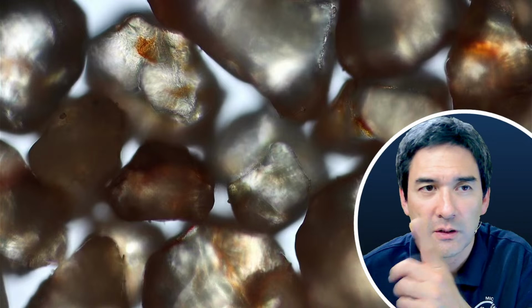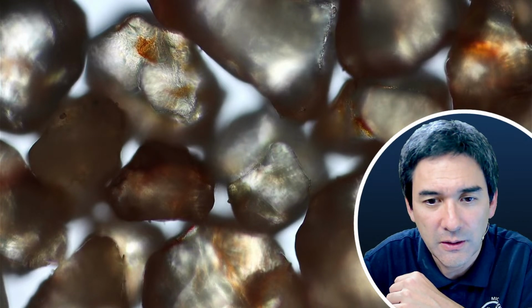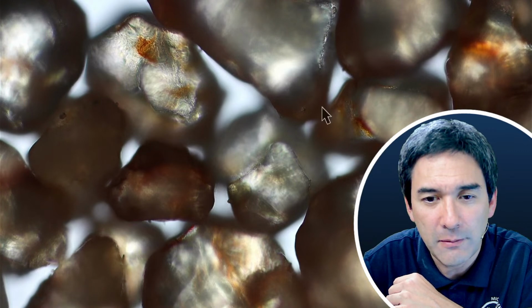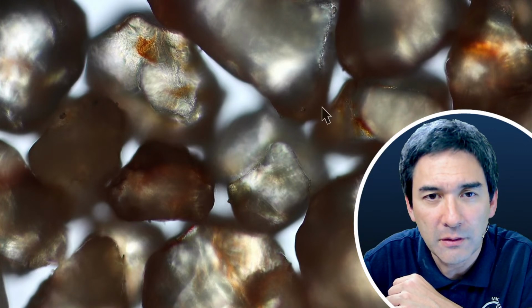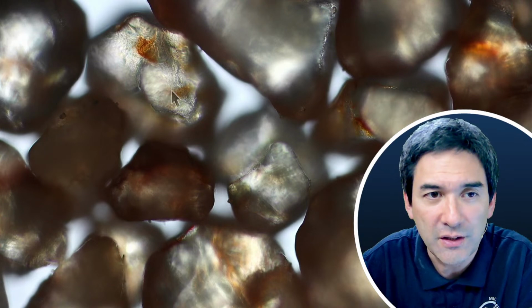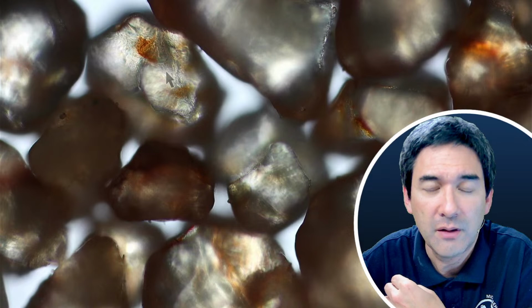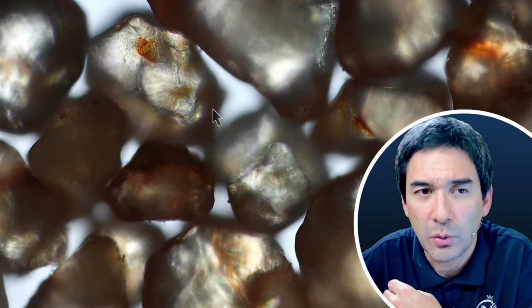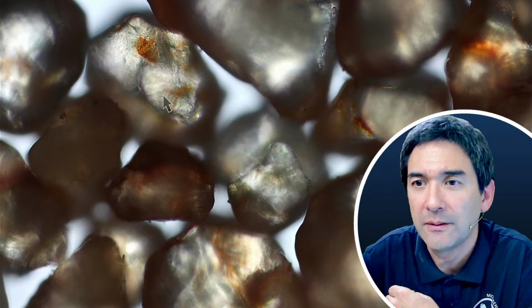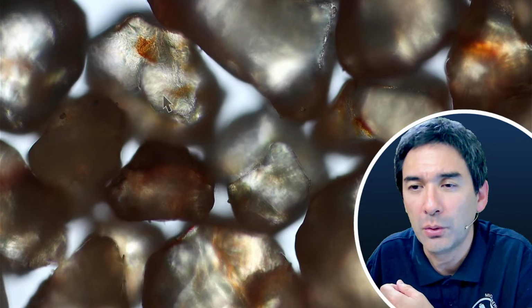So especially if you look at the top left side, where's the arrow? Do I have an arrow over here? Yeah, this is something that I already noticed before, that there are apparently regions in the sand grain that actually make it appear red. So maybe these are patches of iron oxide, rust, I would guess. And I can imagine that when light goes through it and is reflected, it makes the whole sand grain kind of appear more red. So this sand should look very nice under polarized light.